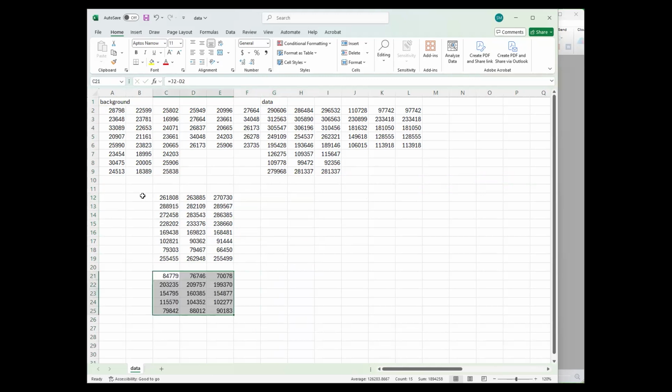All right, so for my standard curve, I have my plate map here at my desk, but this was 100 micrograms per mil of my standard. And then everything was a 1 to 10 dilution from that. So I calculate here my standard curve. This was 0 and this was 0.